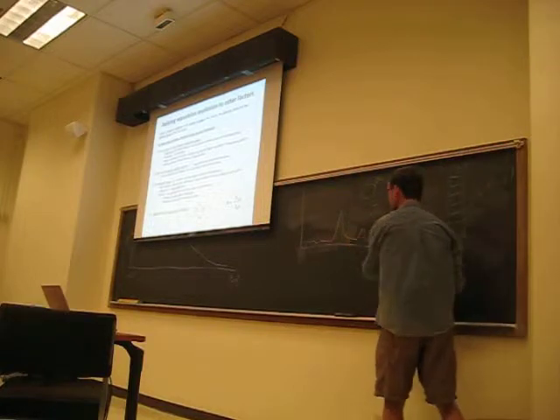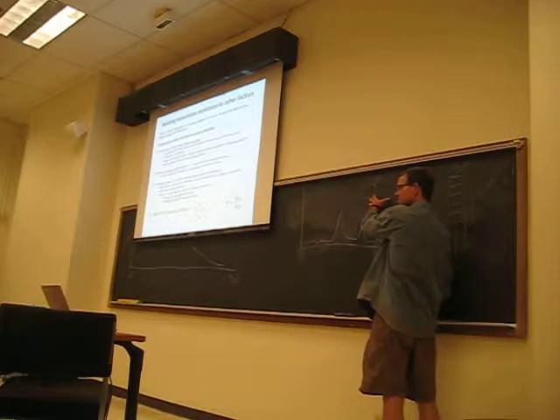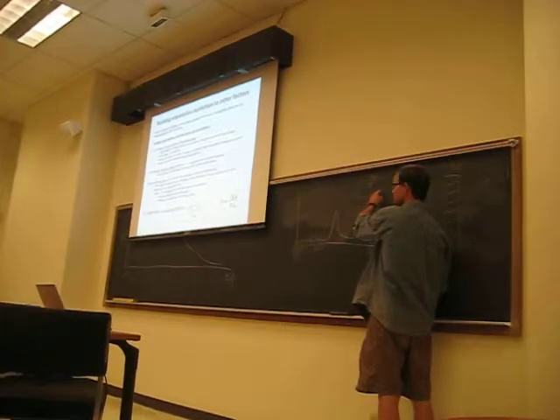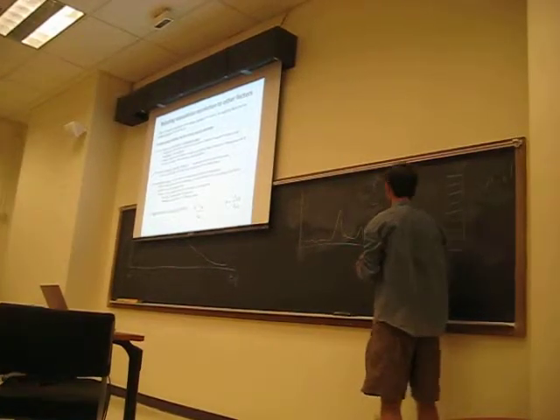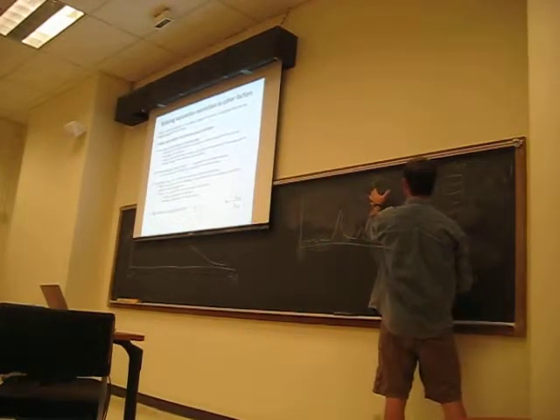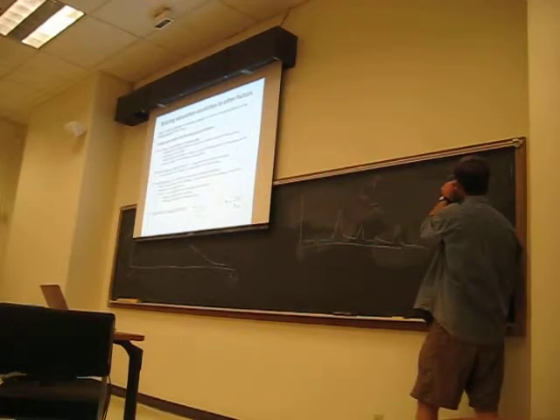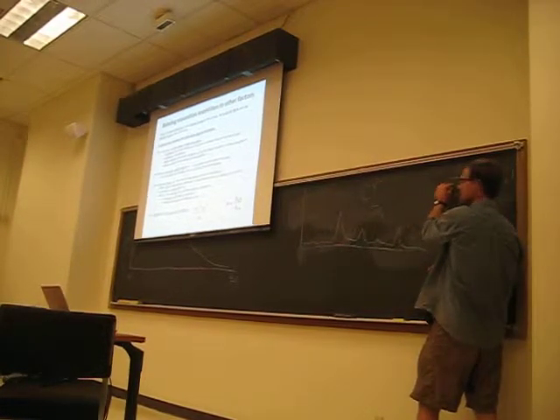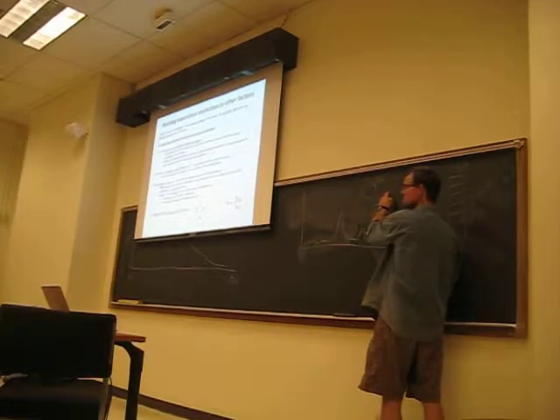How we achieve this is actually through the physical properties of what the column is composed of: the packing of the column, the functionalization of the solid material, what the solid material is made out of, how big it is, its dimensions and so forth. The comparison of the reality with the theoretical construct is that each of these plates that don't really exist is describing the process of partitioning onto the surface of the stationary phase.